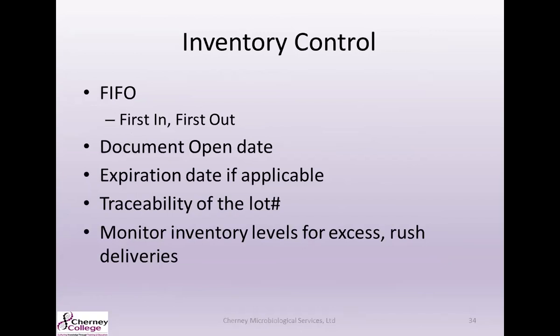For inventory control, you want to make sure to utilize a first in, first out basis. You should use items with the oldest receive date first. And that's done just to make sure that you're using it up before the expiration date. So you're going to want to document your open date, and expiration date if applicable.